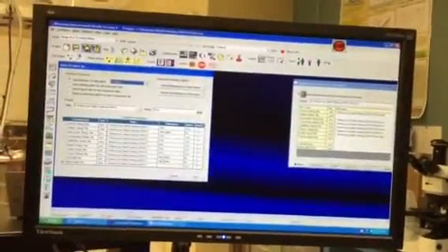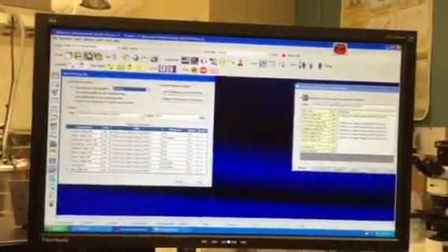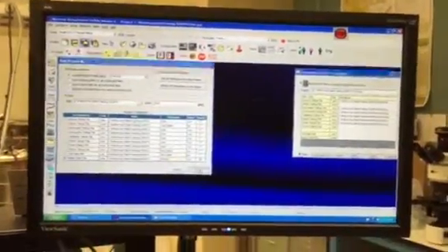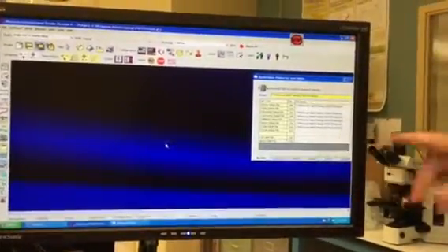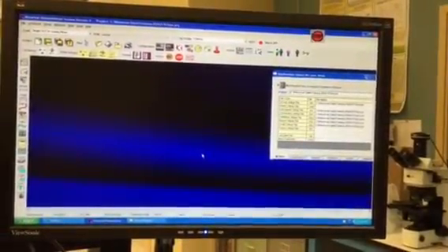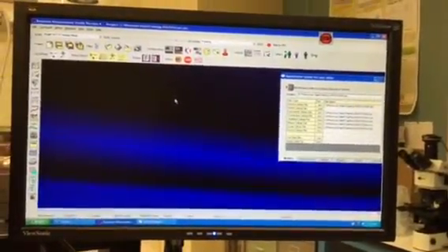I'm just going to save that. Now, what I've been doing down here, see how there is a spot yellow here, that's for the data. I'm just saying I don't care about this data, I'm not going to bother to save it yet. So I'm just saying omit the data when I save the project. So I've got a project, but I don't have any measurement data saved with it. If you were to come back in and recall this project and go to look at reports, you'd be like, where'd my data go? Well, we never saved it. So I made an intentional choice there not to save it.